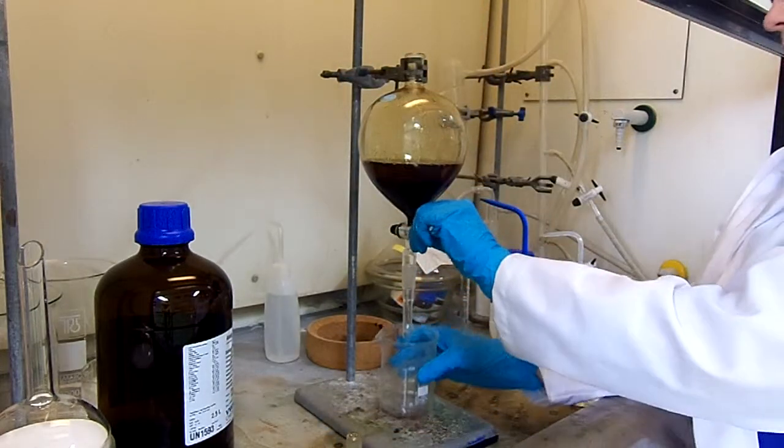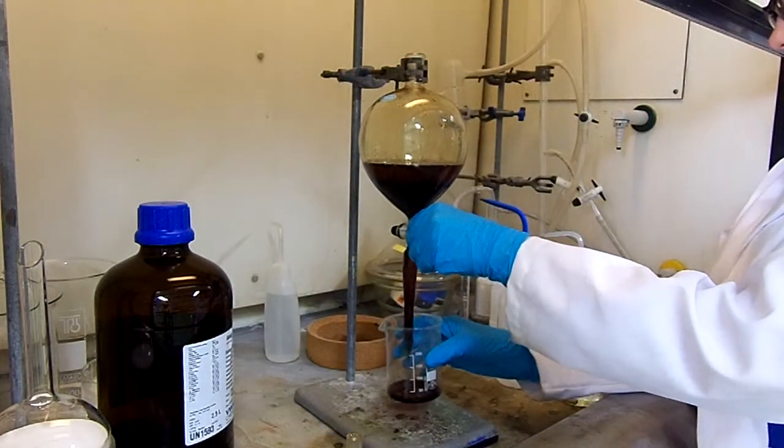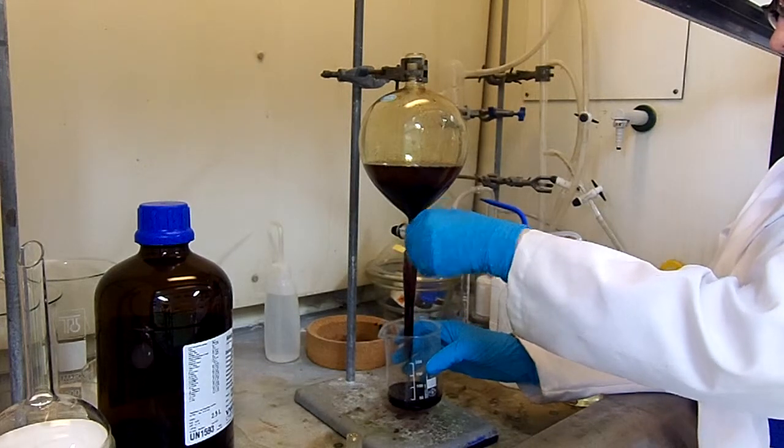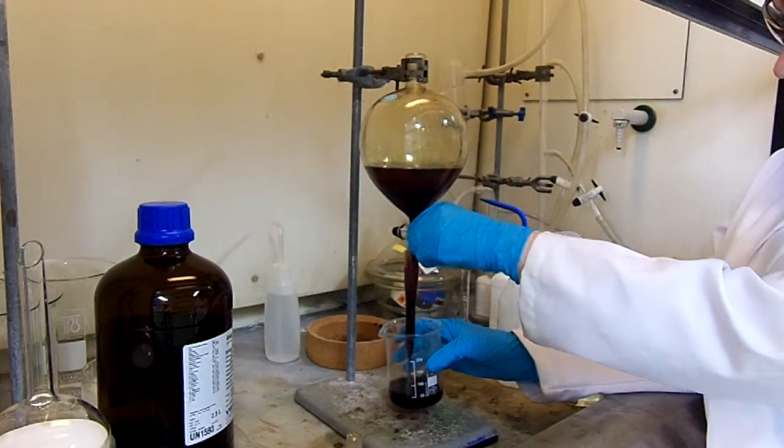As the solvent you are using is chlorinated, this layer will sink below the aqueous layer and will be the bottom, darkly coloured layer in the separating funnel.